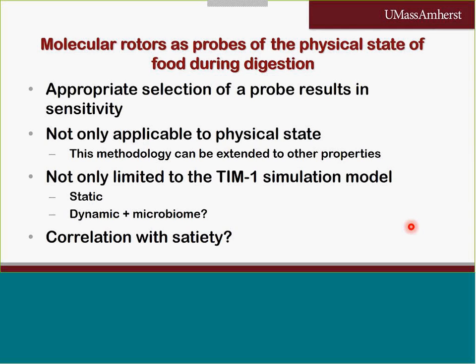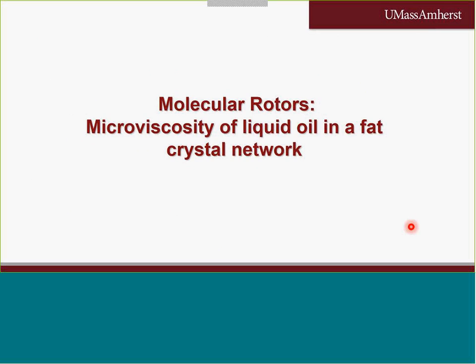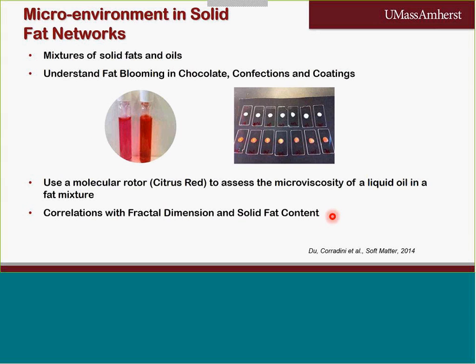Another thing we wanted to test was the viscosity of a liquid oil in a fat crystal network. So basically, in the case of a mixture of fats and oils, the idea is to understand fat blooming in chocolate confections and coatings.